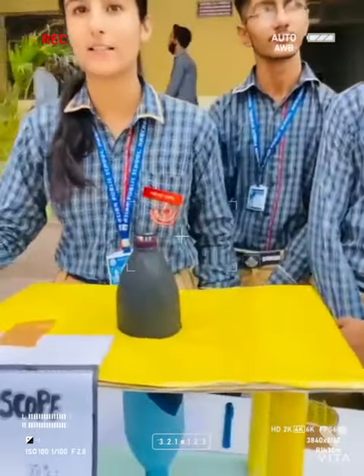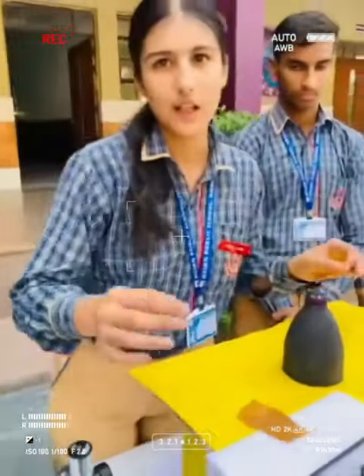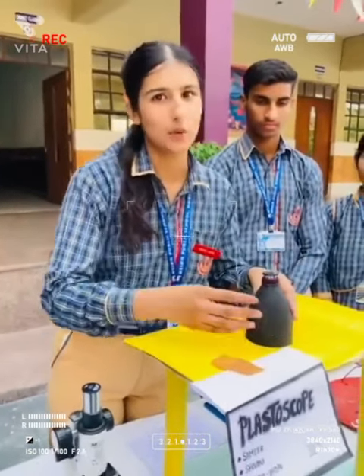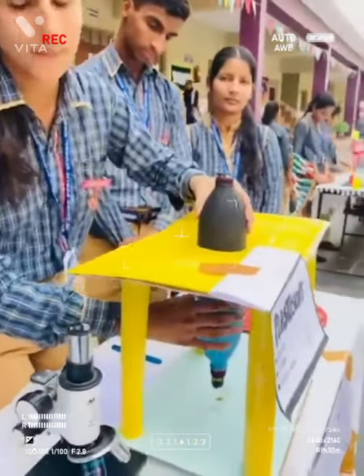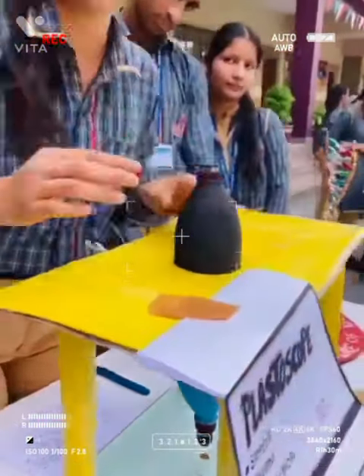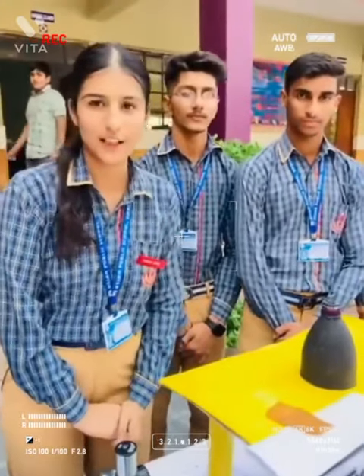It works exactly like this compound microscope. It is very cheap in comparison to this, and it is very user friendly. You can use it just like a microscope — you can do coarse tuning by rotating these bottles, and fine tuning by rotating this cap. Thank you.